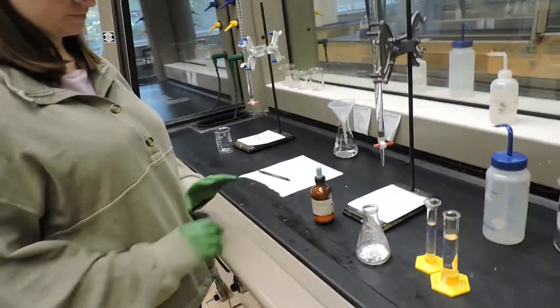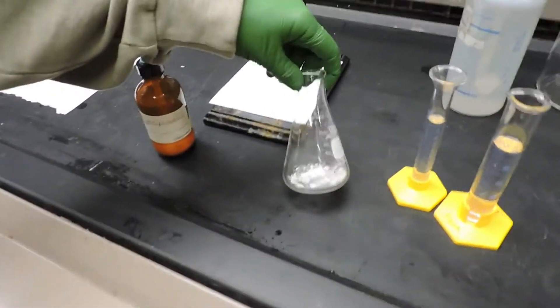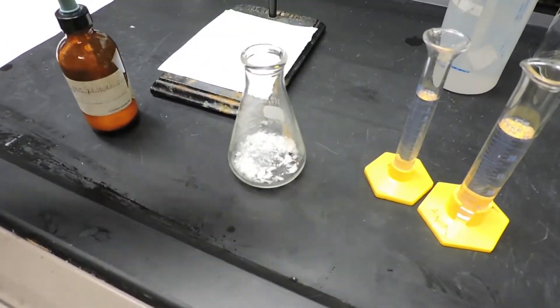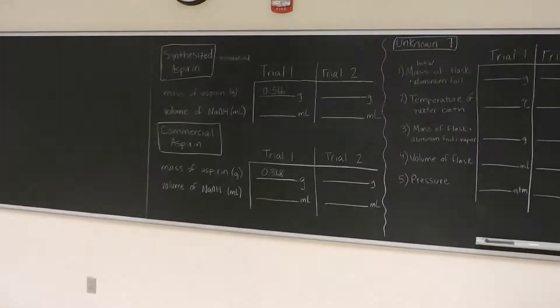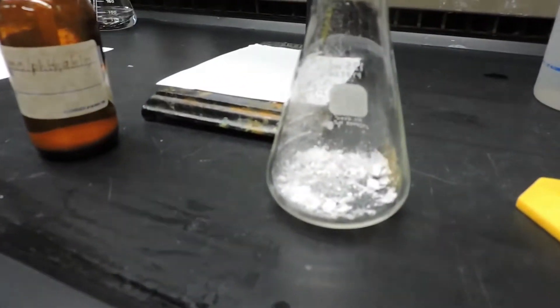The very first step is to weigh out approximately 0.4 to 0.6 grams of aspirin. Here we have weighed out 0.566 grams of our synthesized acid for titration in this Erlenmeyer flask.